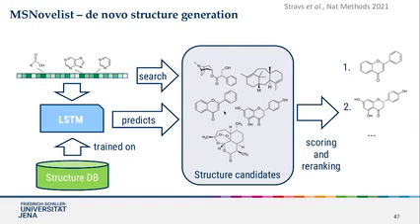And in this structure candidate list, you can then search as you would search in PubChem or in Coconut. Which means you have basically the same scoring methods and the same features as a normal SIRIUS CSI search. So generate a structure candidate list, and then you get a ranked list where the top hit is most likely correct.